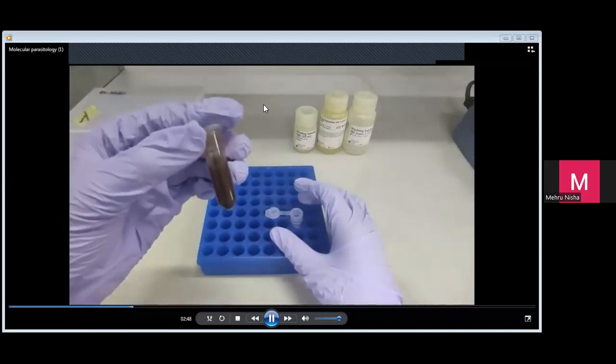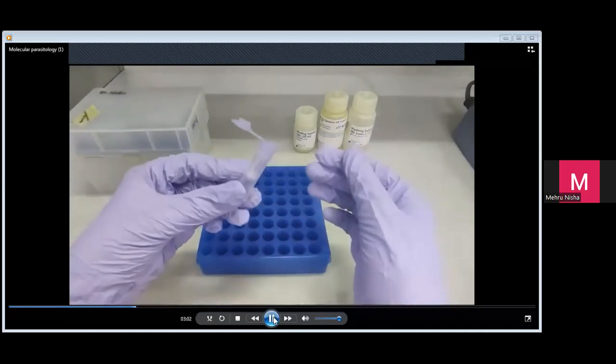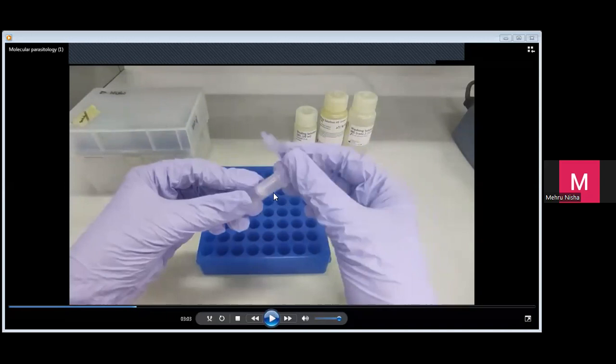Okay. So once it is ready, we transfer it to a tube like this, which is provided by the supplier. The tube below we call the collection tube. The one on top, if students look, is the membrane filter tube. The membrane filter tube is very important because it doesn't let the coarse materials go down.